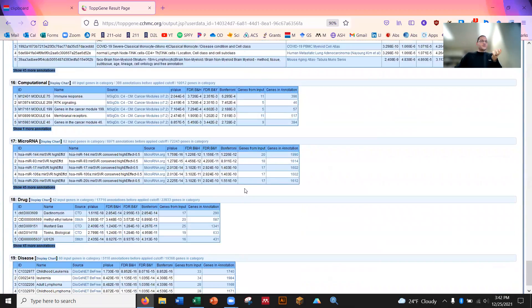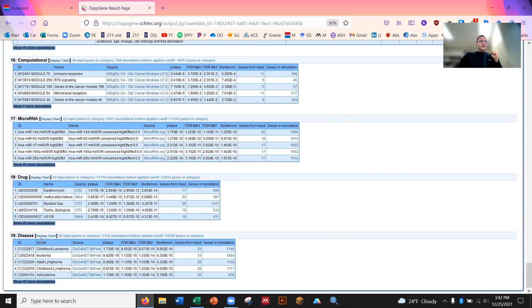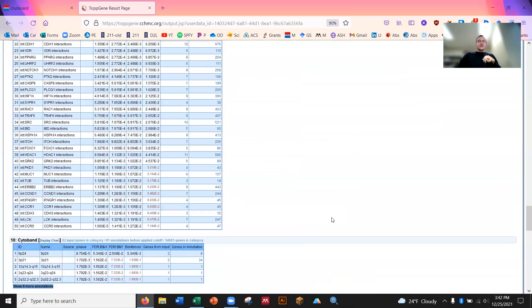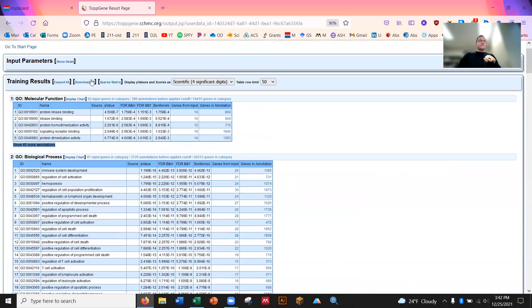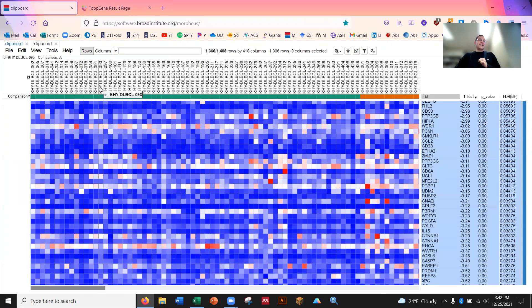Again, this is pretty good. Drug shows up sometimes, but it's not very reliable to say like treat with this drug. It's not really that. Disease, as you can tell, leukemias, lymphomas, again, a good sanity check. So that's how you can use top gene, top fun, top functional enrichment is what it's technically called.